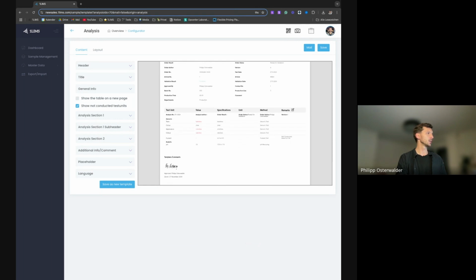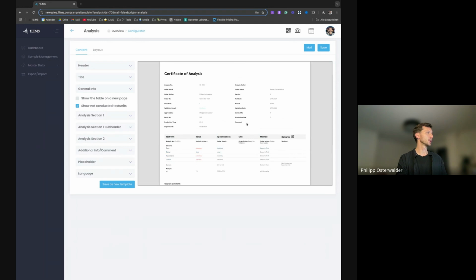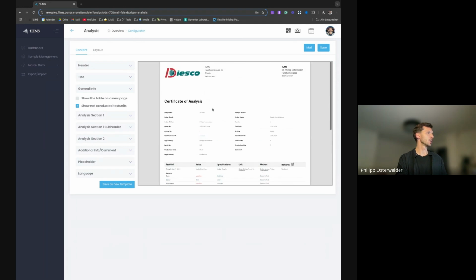There are some different kinds of values on here. Also, the coloring or even the template can be adapted. At the end, the validation result is conform, so everything is fine for that.